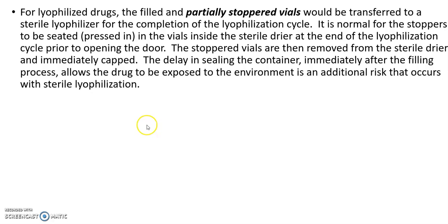And if there's lyophilization, freeze drying, happening after vial filling, your stopper will be partially pushed in, meaning stoppers will be just loosely positioned on top of it, and then it's going to move into the freeze dryer. So you will give enough space for the vapor to escape. That's what it means. And the stopper will be sealed after the full freeze drying process.